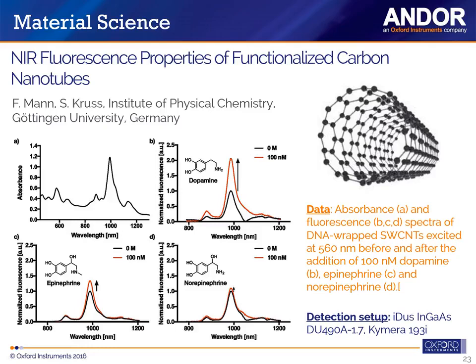added. And these are a type of research for the likes of biosensors, so being able to inject luminescent material within carbon nanotubes, within tissues or within organisms, and being able to do some level of imaging, for example, fluorescence imaging. So these are novel ways to deliver these fluorescent probes to different parts of different tissues or different parts of the body.